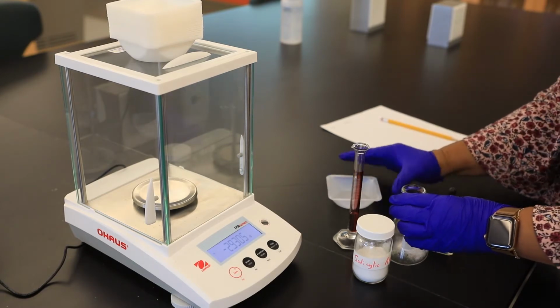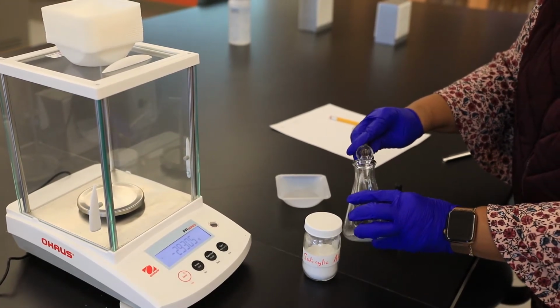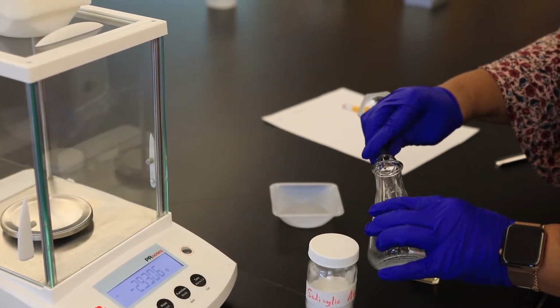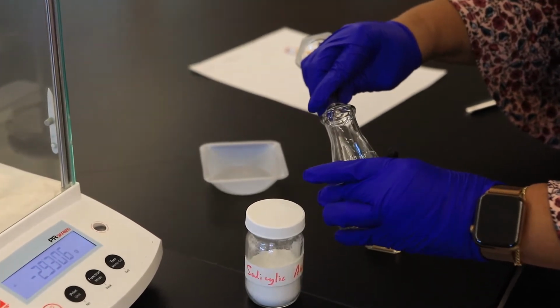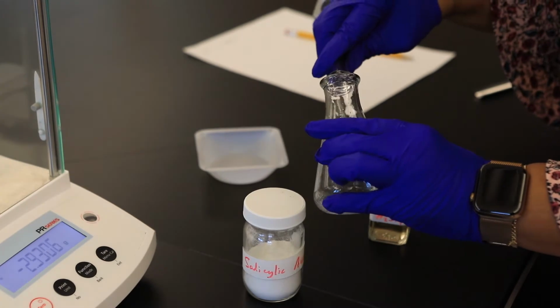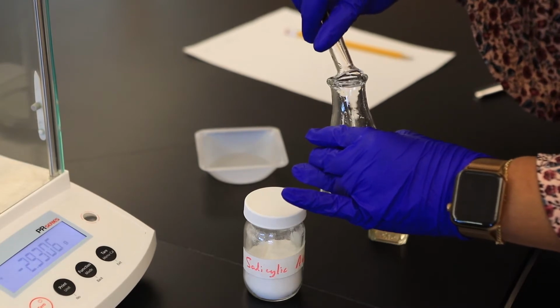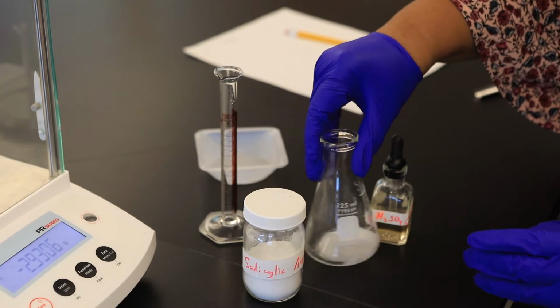And then in addition to that, I'm going to be adding the acetic anhydride. I'm going to pour as slowly as possible to see if I can wash some of the solid that's adhering to the walls of this container down. So I've added our 4 mLs of acetic anhydride, which is in excess.